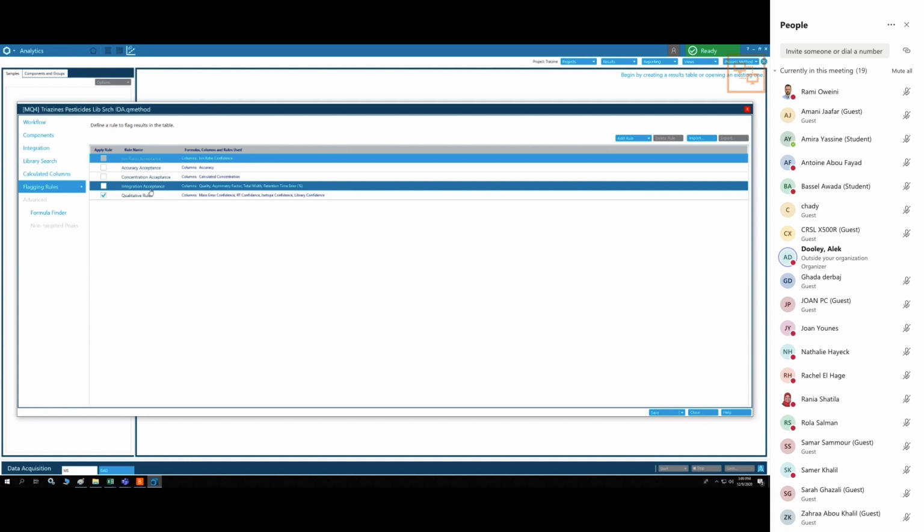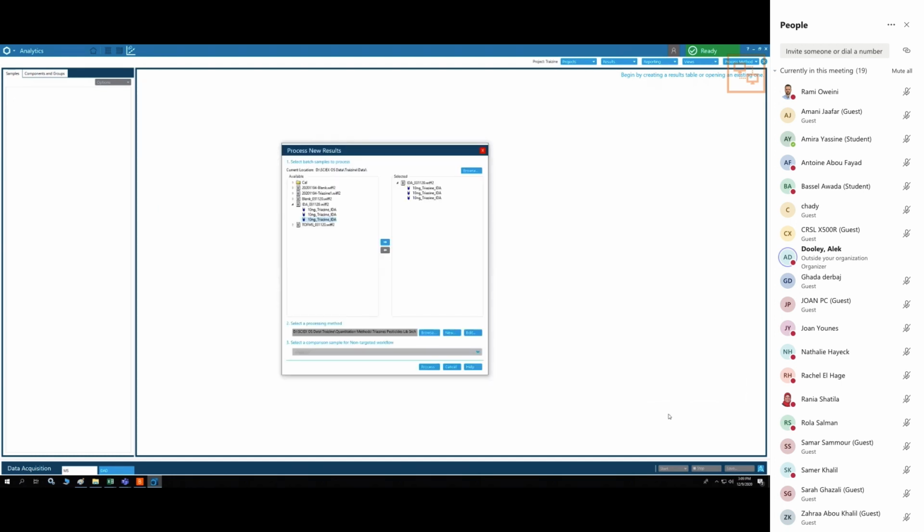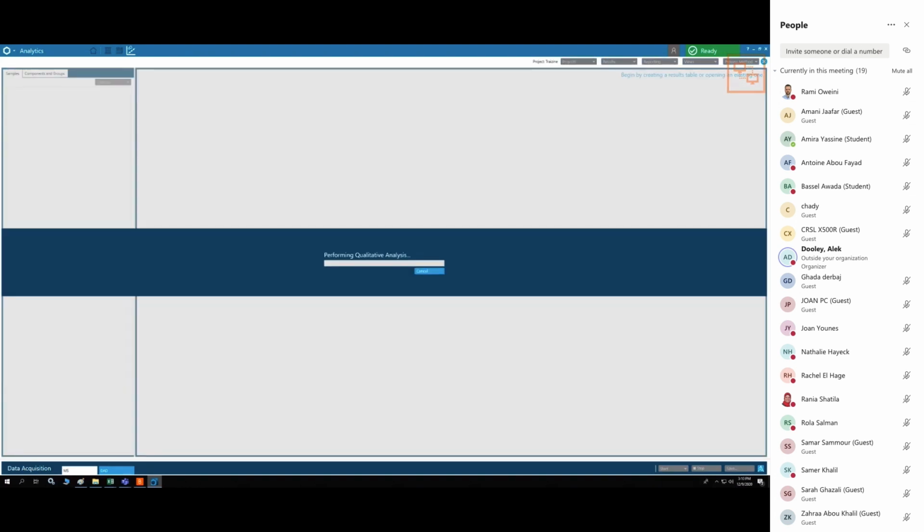All right. Any other questions? Okie doke. So I will say save, and then I will say process. What we're going to do when we say process is process these samples using this method, and we will get a chart behind here. You see this white space. This white space will fill up with a chart, which will be all of our results.